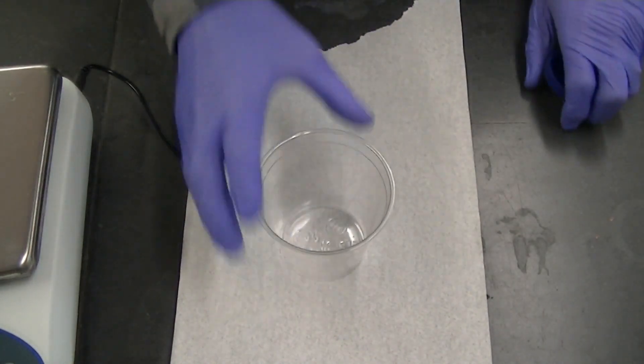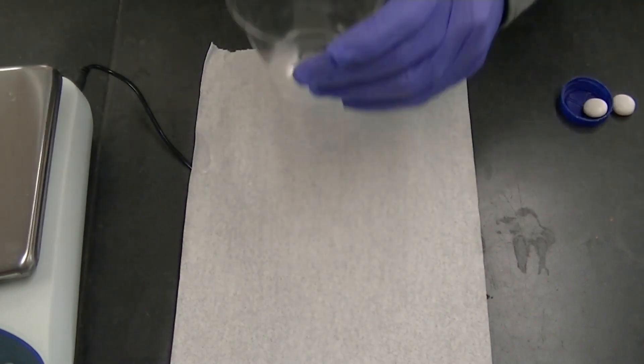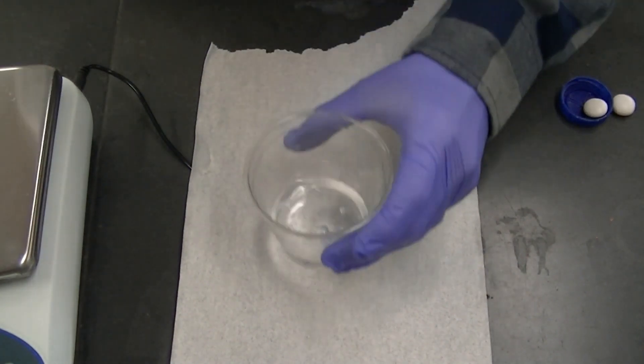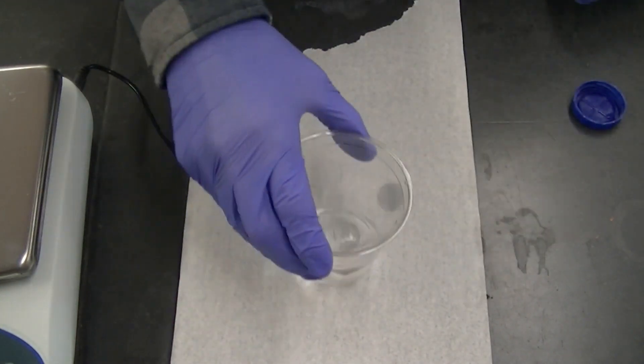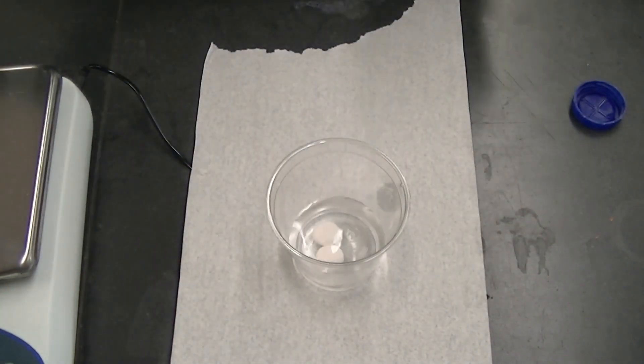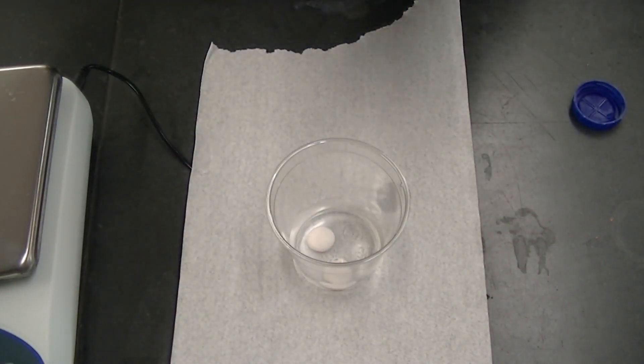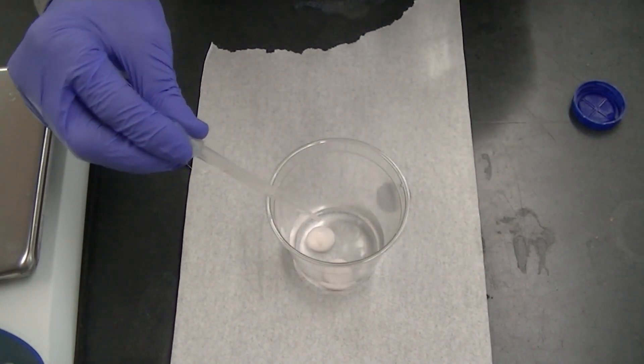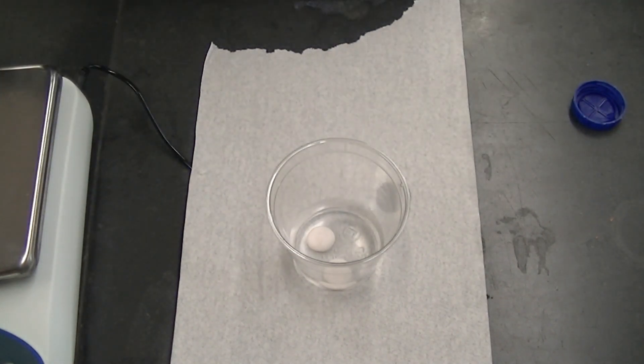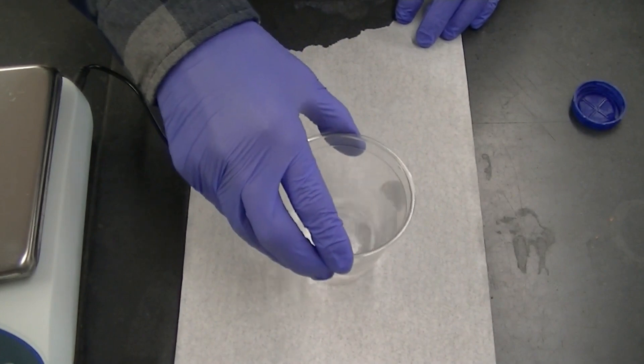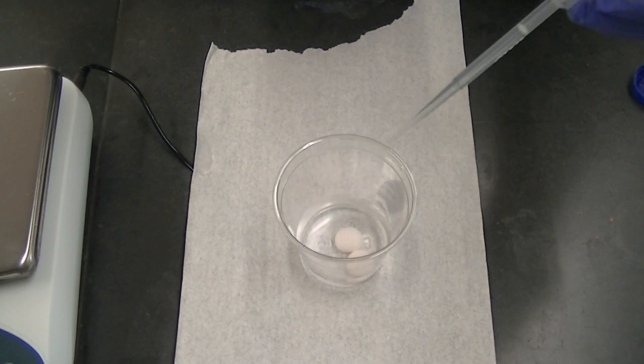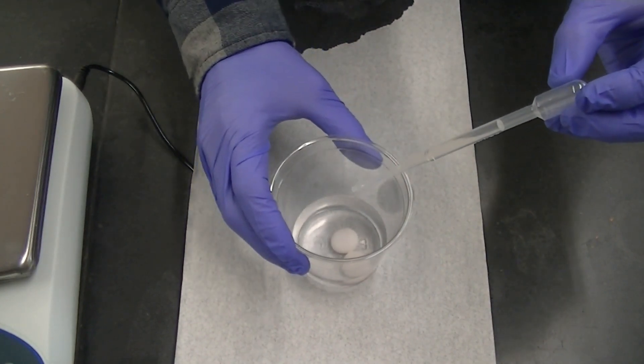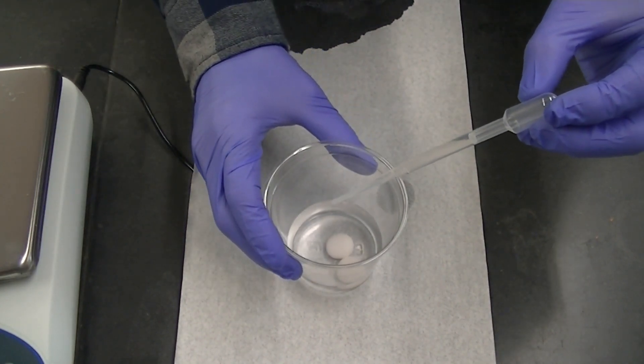Now as a control, we're just going to take some deionized water and I'm going to add some Mentos candies to it. We'll add a squirt of thymolphthalein. And let's see how many drops of base it takes to make the blue color appear with the deionized water to which Mentos candies have been added.